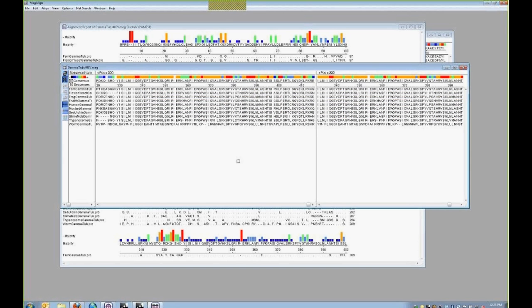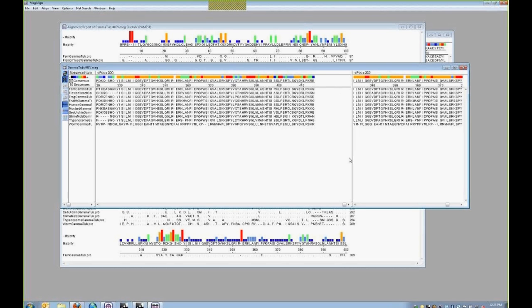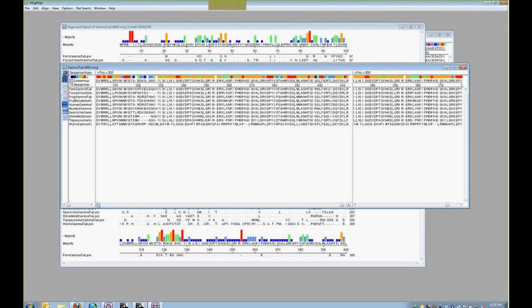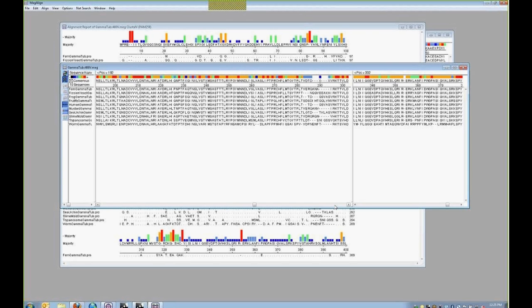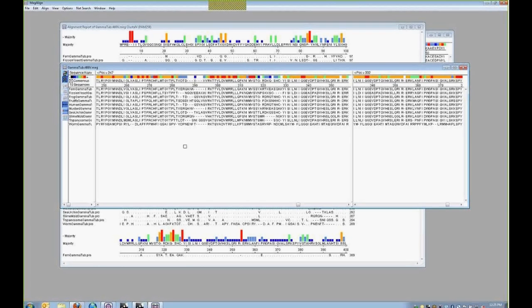Great. Thank you. Okay. So with those views shown, we do have a couple of other views where you can view residue distance and residue substitutions tables, but they're not quite as interesting as the tree or the alignment report. So I'm going to go ahead and skip those for now. With that said, however, what I do want to show you is variations in how the algorithms deal with the variations within the alignment.